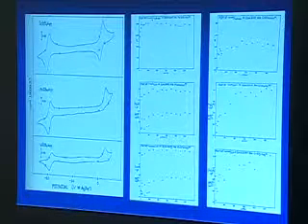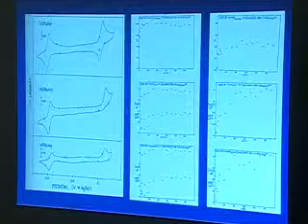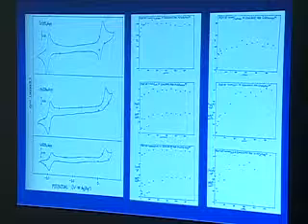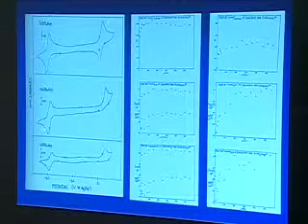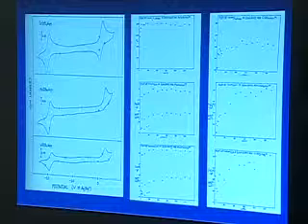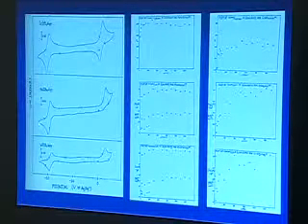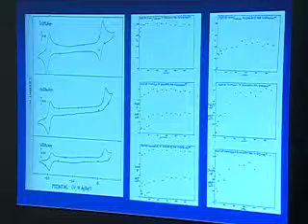The idea is, I do a cyclic voltammogram. If I do it at sufficiently fast speed, and the ligand falls off pretty slowly in this case, so sufficiently fast isn't that fast, then by the time I get all the way around here, none of the COs have had the opportunity to fall off, basically. And so I can reduce all the molecules that I oxidized over here if I'm scanning fast enough.